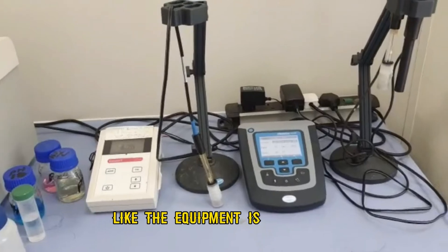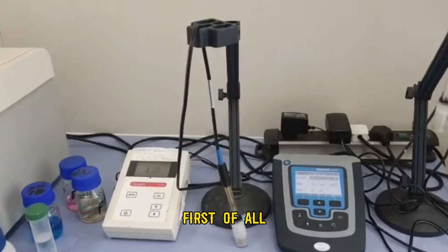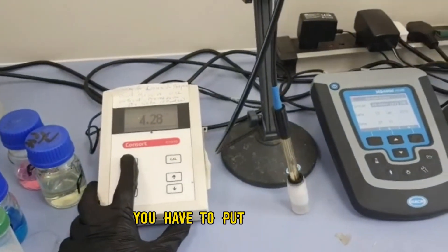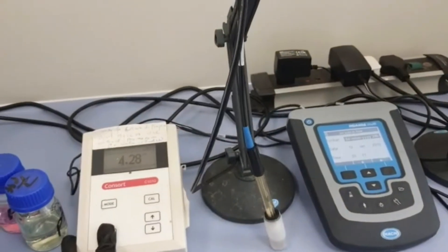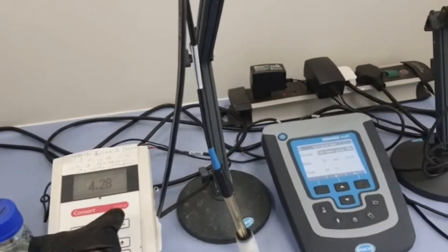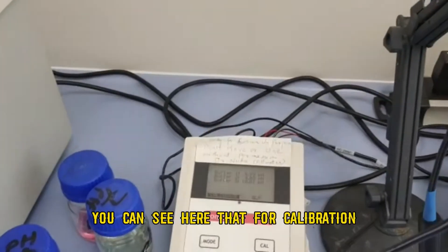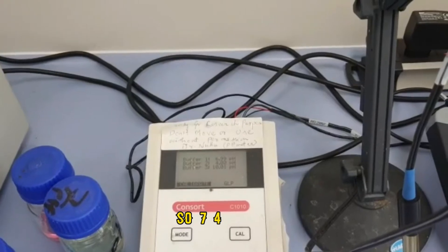To measure, first of all you have to make sure your equipment is calibrated. For that, you have to set the mode on the first device. Press the CAL button. For calibration you need three buffers: pH 7, pH 4, and pH 10.